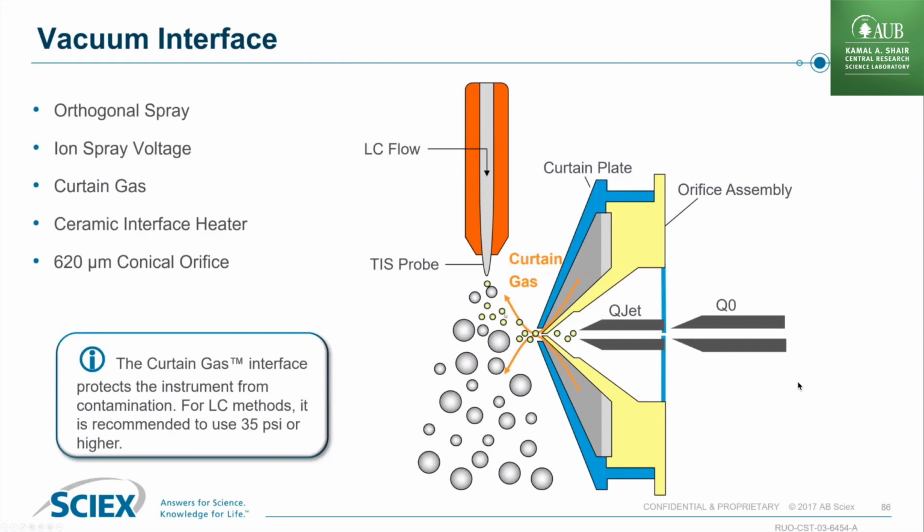You see the ions are this kind of light green color. We manipulate the ions into the instrument with electrical fields. So here at the source, we talked about this already, we have thousands of volts. At the detector, way back here at the end of the instrument, we have thousands of volts, the opposite polarity. So that polarity difference is pulling the ions through the curtain gas and into the instrument.